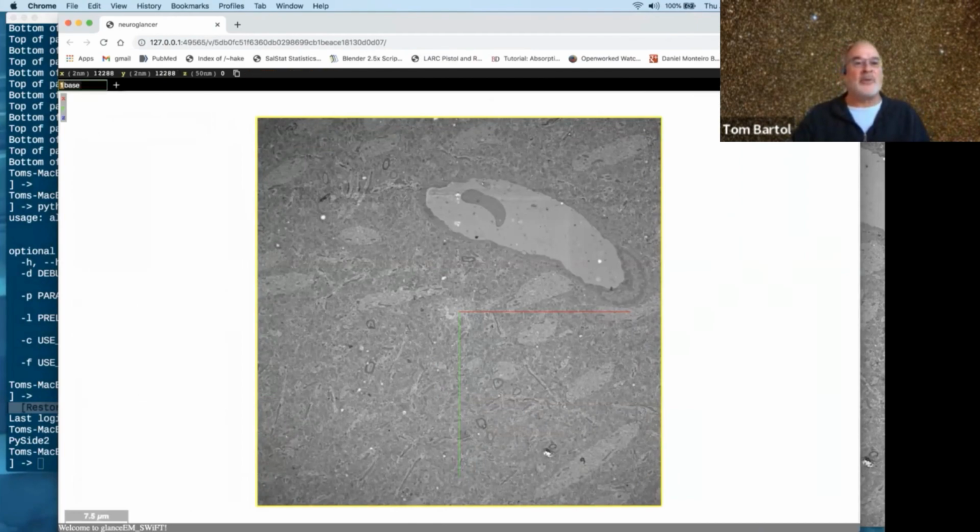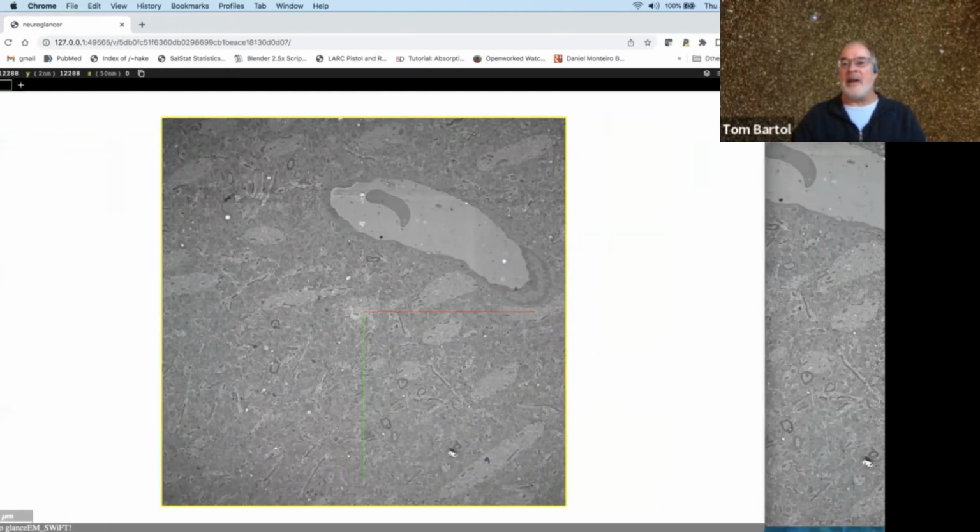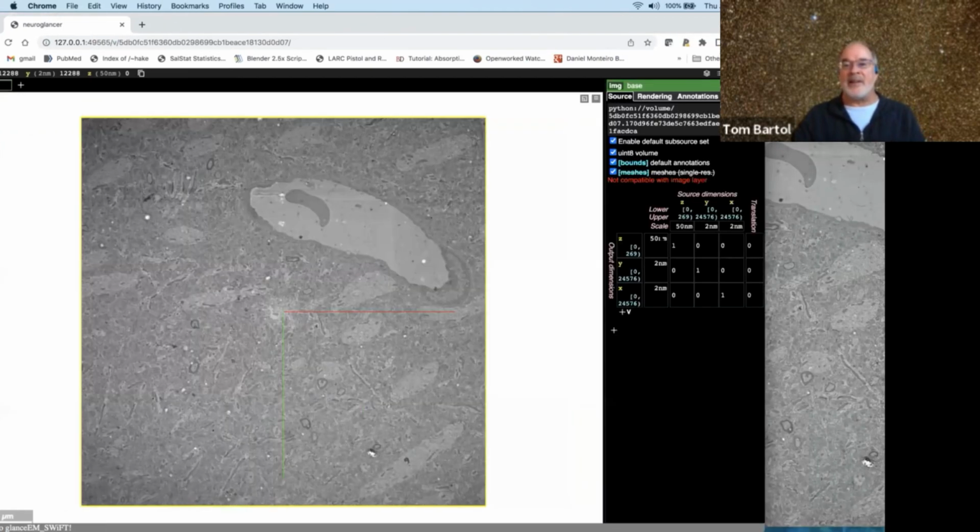And if you look at the X, Y, and Z coordinates, dimensions, or pixel size up here, last week it said Z, Y, X in the opposite order. Now it says X, Y, Z in the right order. If we look at the metadata for it, it says ZYX because that's the order of the data that's actually in the data set.